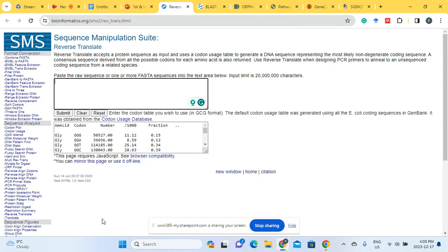In this video, we will learn how to translate the nucleotide sequence, compare the nucleotide sequence query against bioinformatic databases to find the gene of origin or genes with similar sequences, and learn how sequence data is represented in FASTA format. First, I will demonstrate how to retrieve nucleotide sequence.